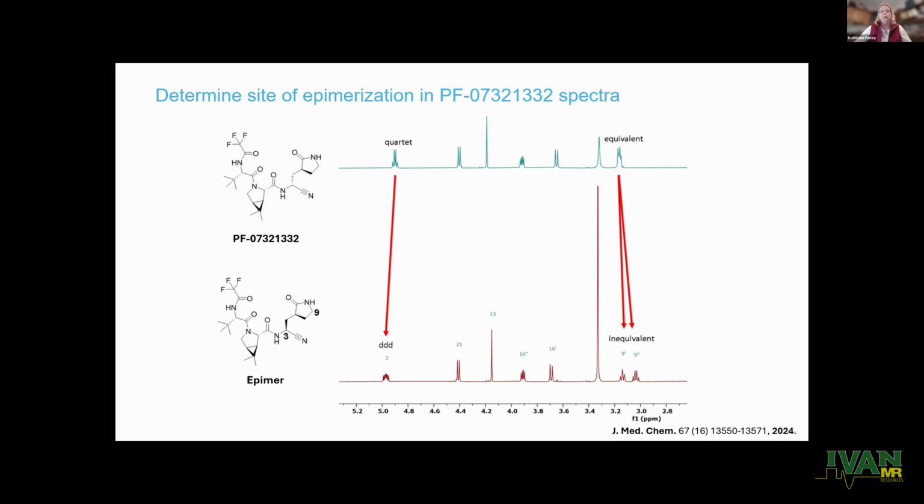but initially the chemists weren't sure what was going on. And once we had this identified and we sent around an email to all the chemists on the team and said, this is what you need to look out for, they became our watchdogs, and pretty much most compounds that had this epimerization problem weren't even submitted for final testing.